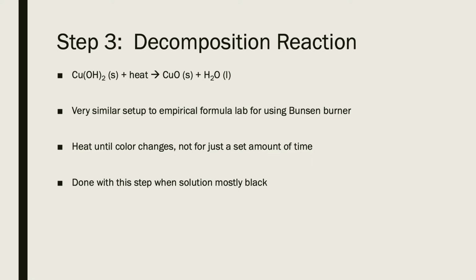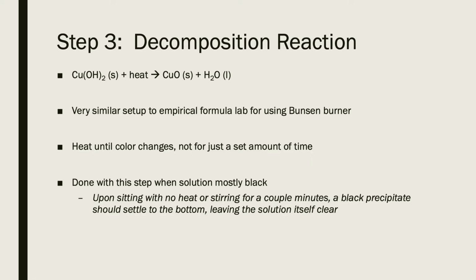If you've been heating it for a really long time and you haven't seen a color change, then that's kind of a problem. You should see that color change happen relatively quickly. If you don't see a color change, there's a couple things that could have happened. One, you might just have your flame way too low below the beaker and you're just not heating the beaker enough. That's a possibility. But the other one is if your flame has been heating the solution and you can see it almost boiling and the solution is still blue, then you can heat it a little bit longer. It shouldn't take much longer if the solution's already boiling to get that color to change from blue to black.